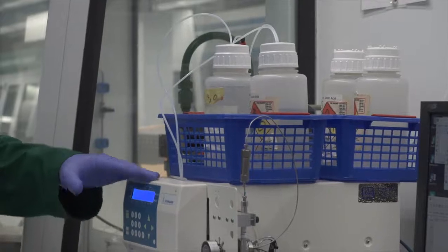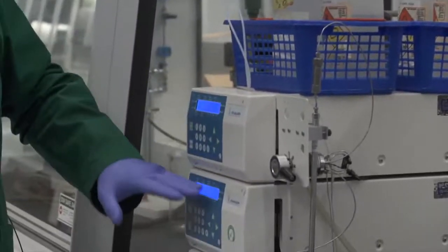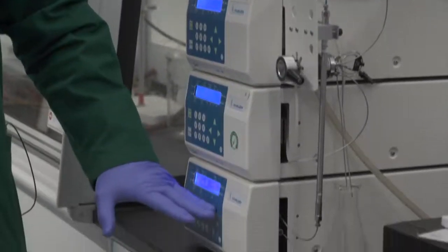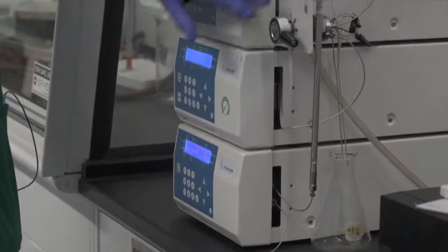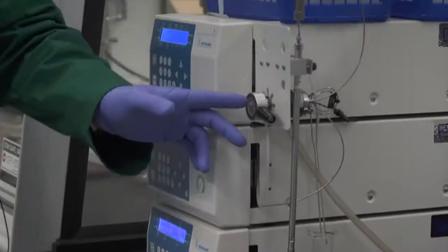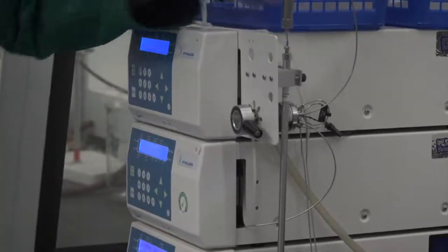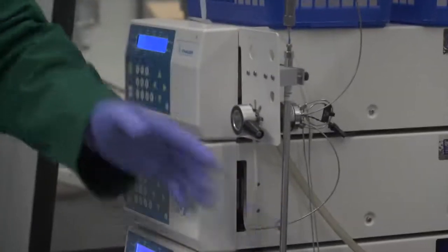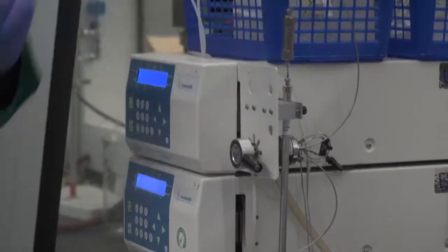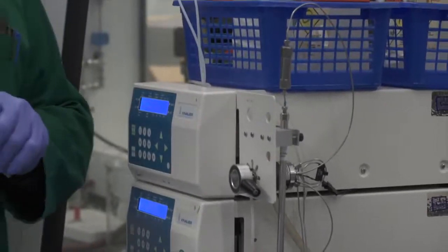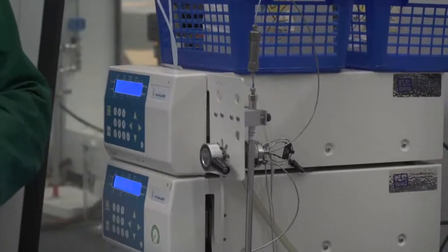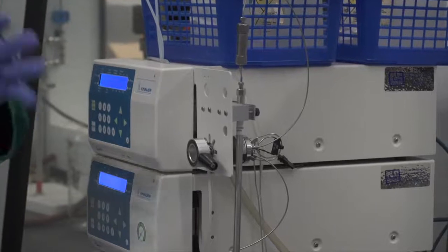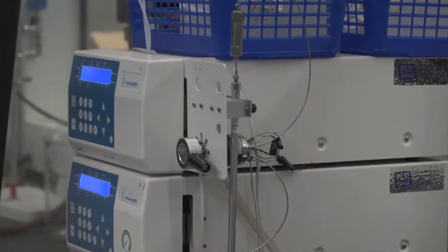Next you have the two pumps A and B and the detector. On the side here you have the injection port, guard column, analytical column, and on the back side of the injection port you can see the sample loop. These are all the main components of the instrument.